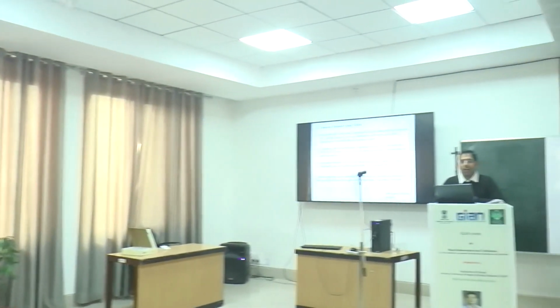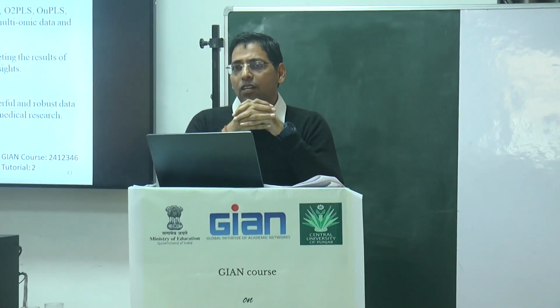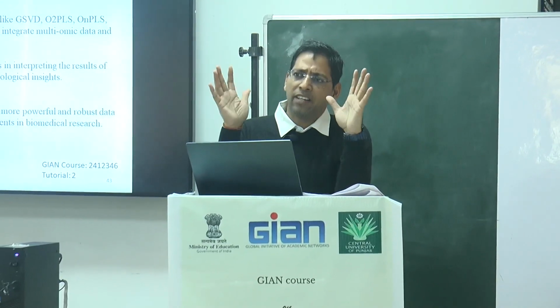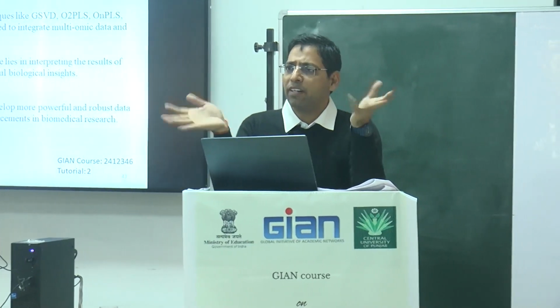Actually, I have a full presentation on this point. This is a very big question and it has an elaborate explanation. In simple language, a solution has many analytes, and we want to separate them.